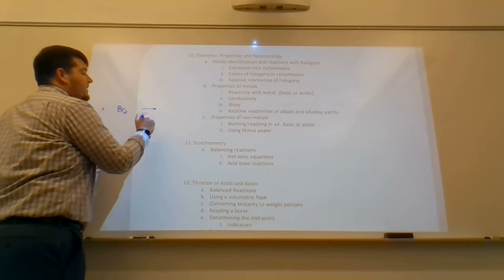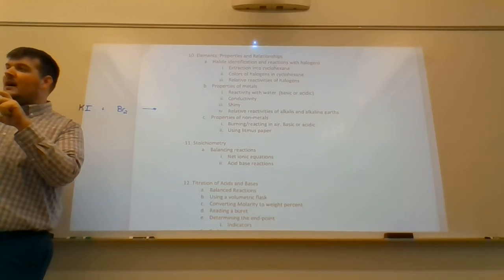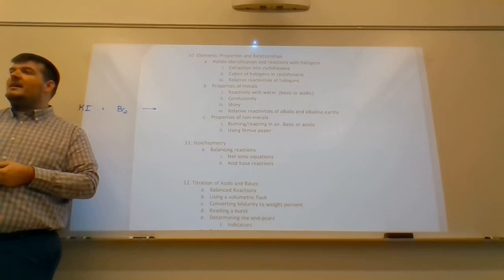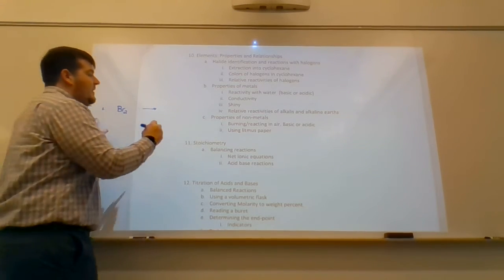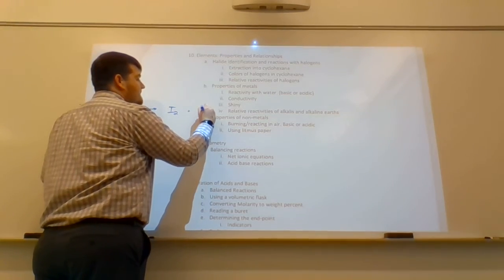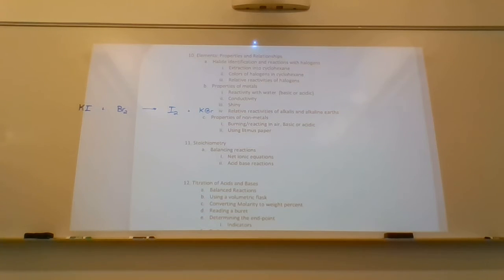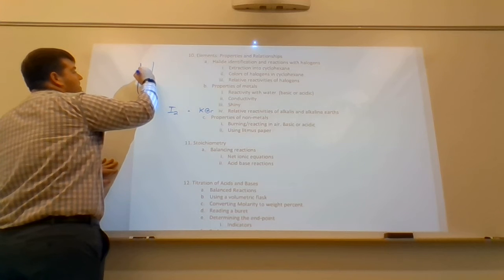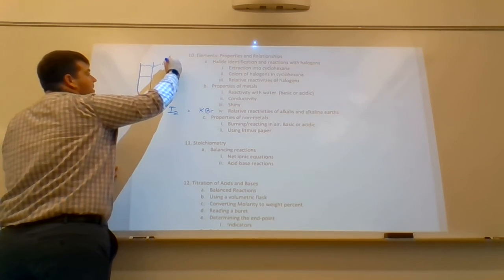After that happened, we put some cyclohexane on top and we mixed it together. Why did we put some cyclohexane on top? Because if a reaction happened here, this would be the reaction. Is everybody with me on that? Now, what goes into, so remember, cyclohexane was less dense than the water, so this is the cyclohexane layer here.